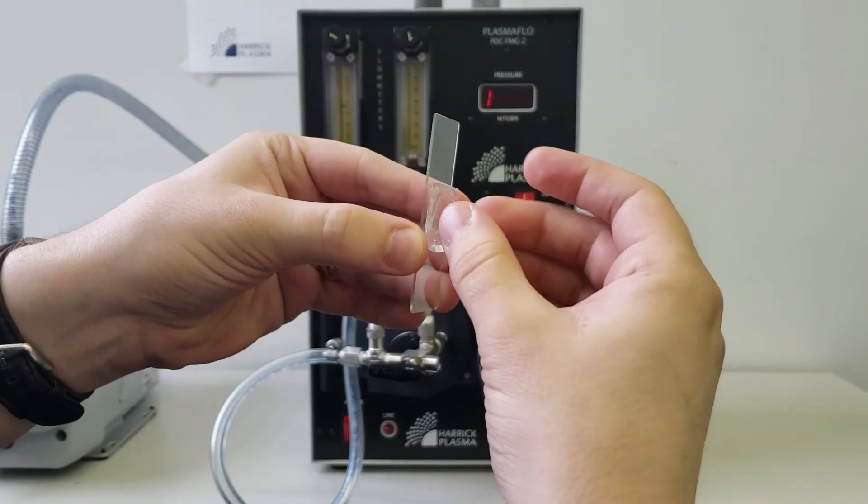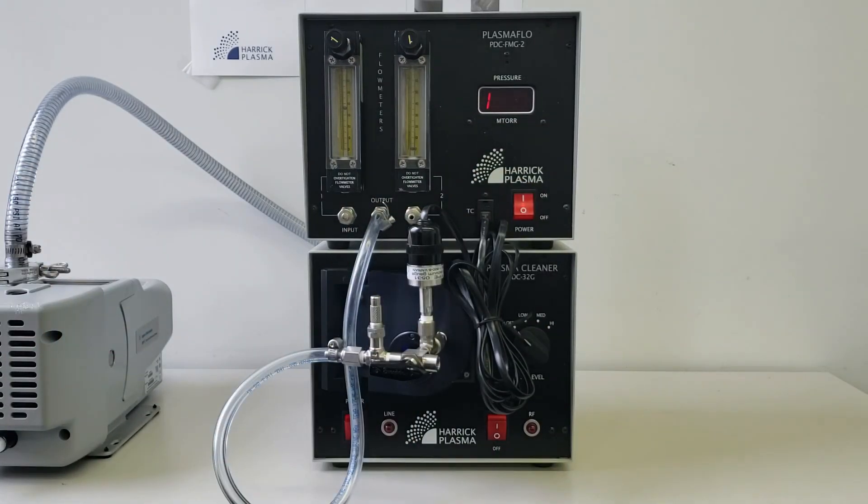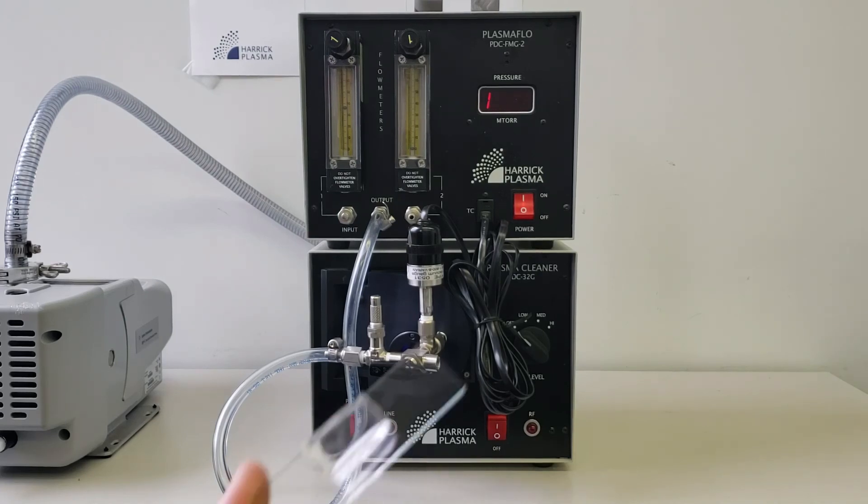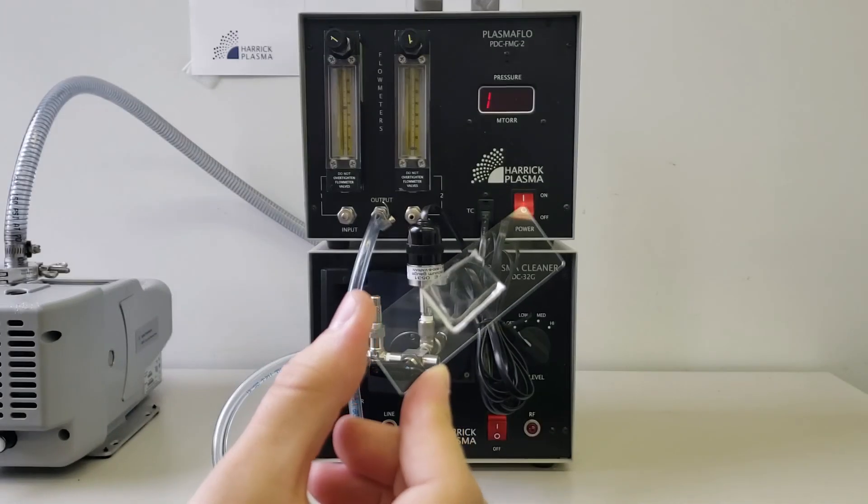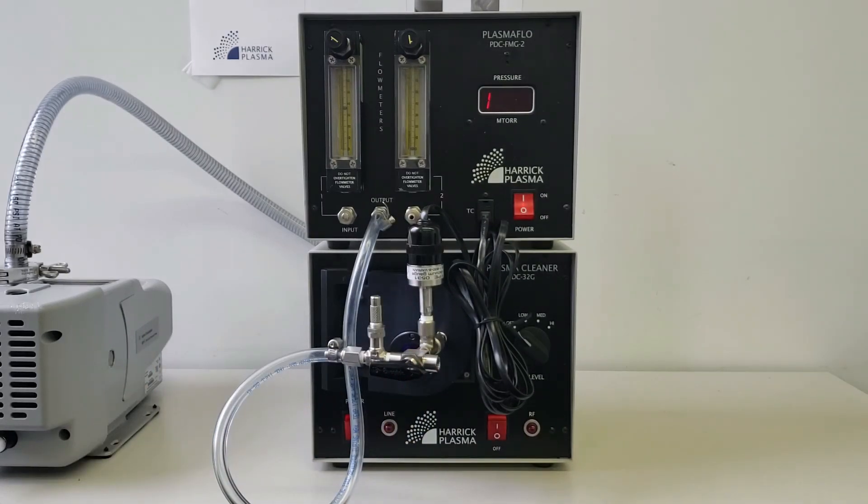In some cases, immersion in a polar fluid can preserve surface hydrophilicity. Additionally, many labs heat the assembled device at around 80 to 100 degrees Celsius for 60 seconds. This can be done with a hot plate or an oven. The high temperature provides activation energy for additional bond formation.